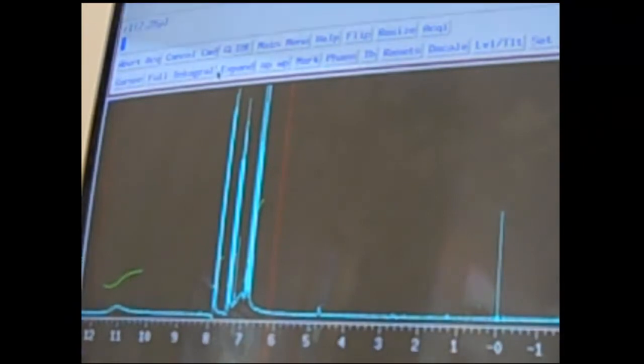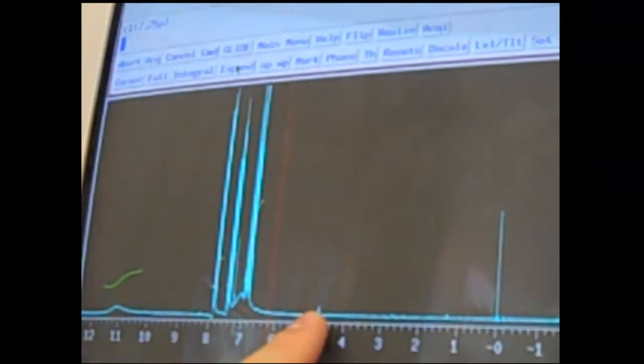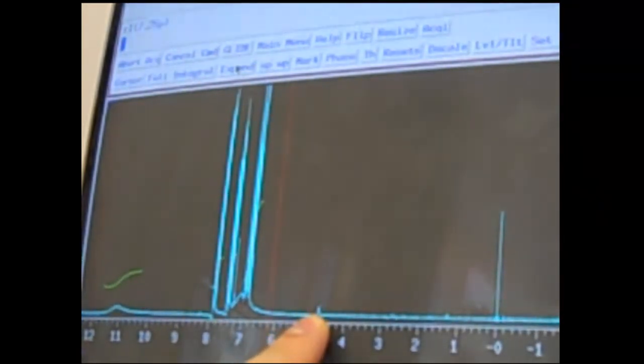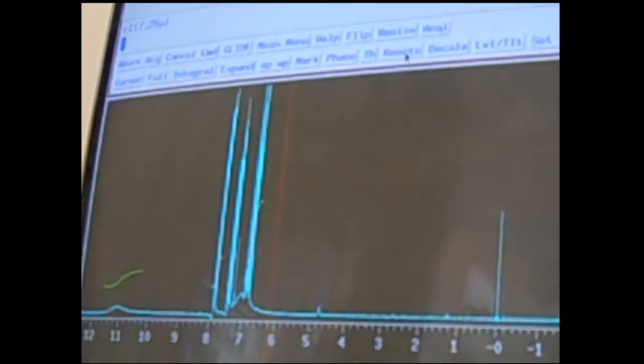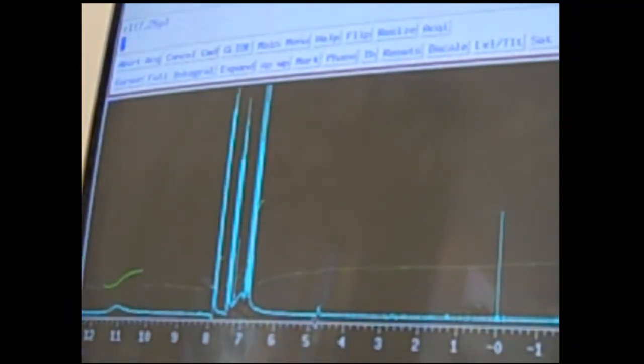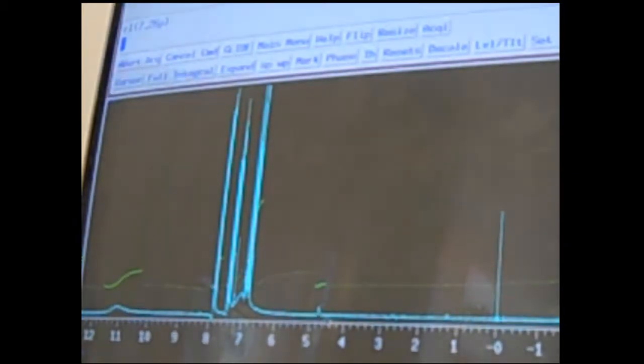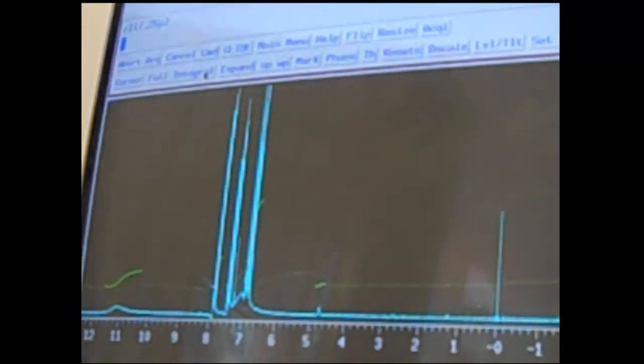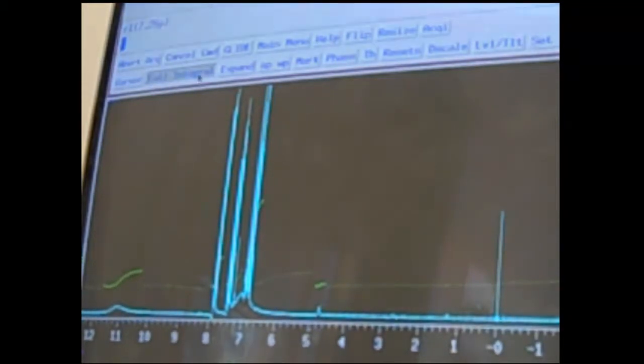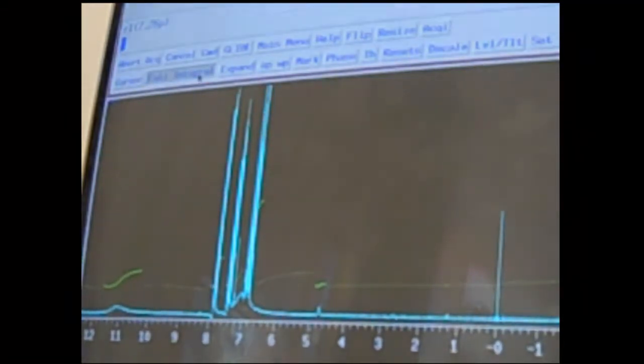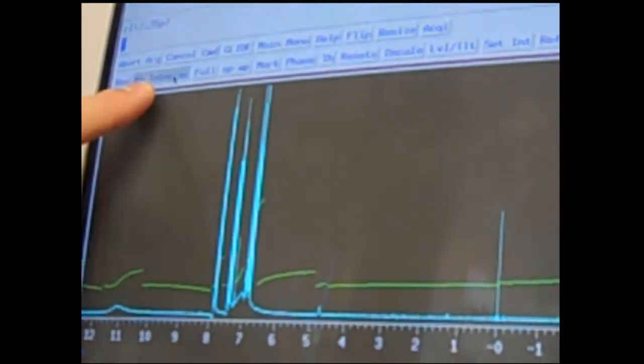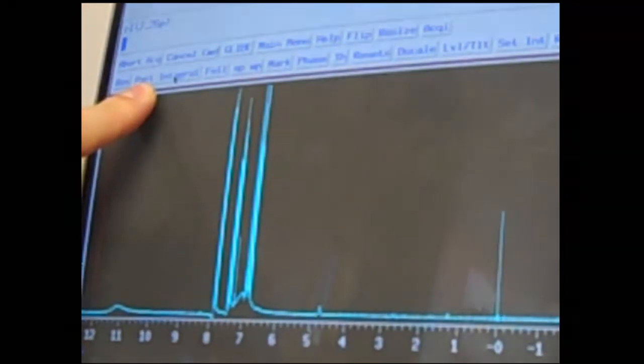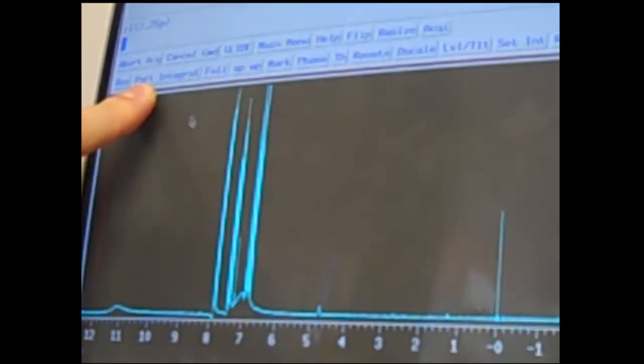Now everything is integrated, and I can go out to my full spectrum by clicking on full. If there are small trace impurities, like this small peak right here, you're welcome to also integrate that by clicking resets again and then left-clicking on both sides of that peak. When you're finally done integrating, click the integral buttons back to partial integral.